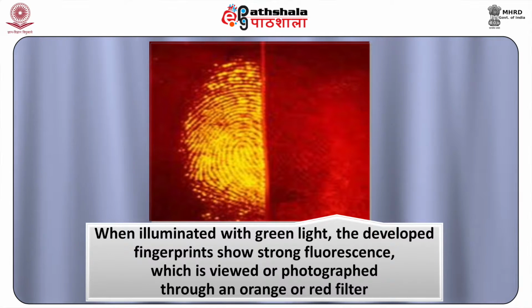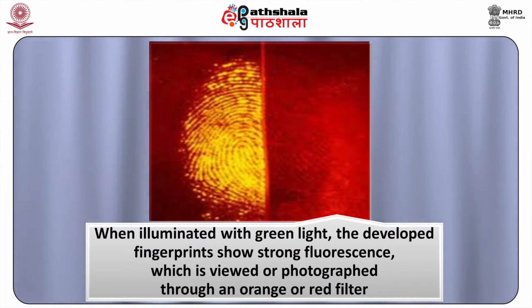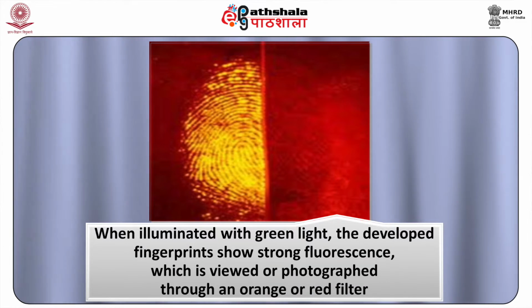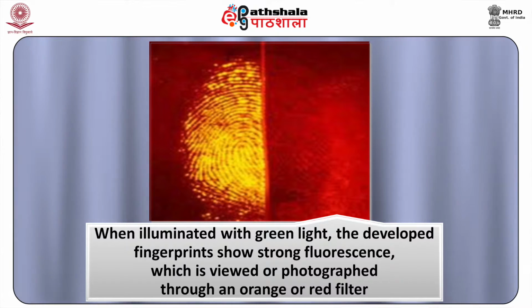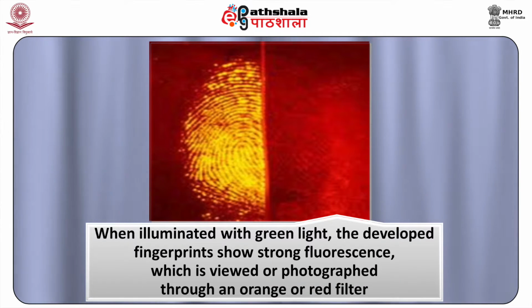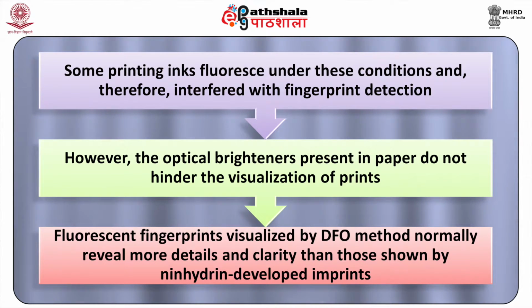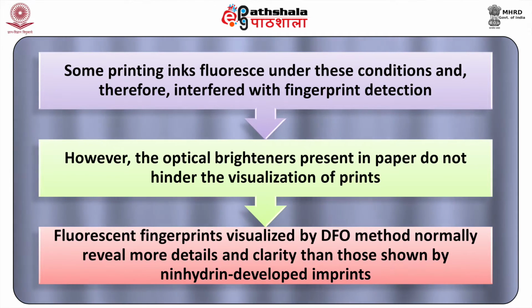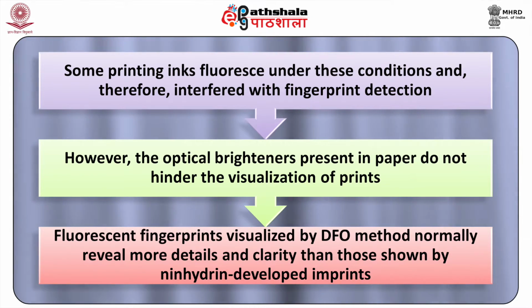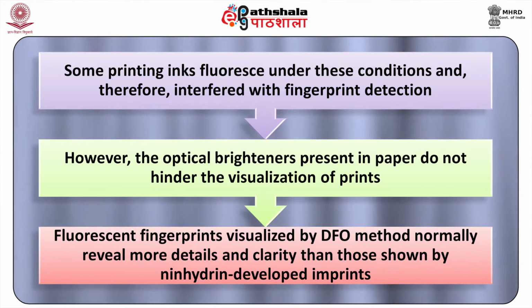When illuminated with green light, the developed fingerprints show strong fluorescence, which is viewed or photographed through an orange or red filter. Despite the enhancement afforded by fluorescence, some printing inks fluoresce under these conditions and therefore interfere with fingerprint detection. However, the optical brighteners present in paper do not hinder the visualization of prints.